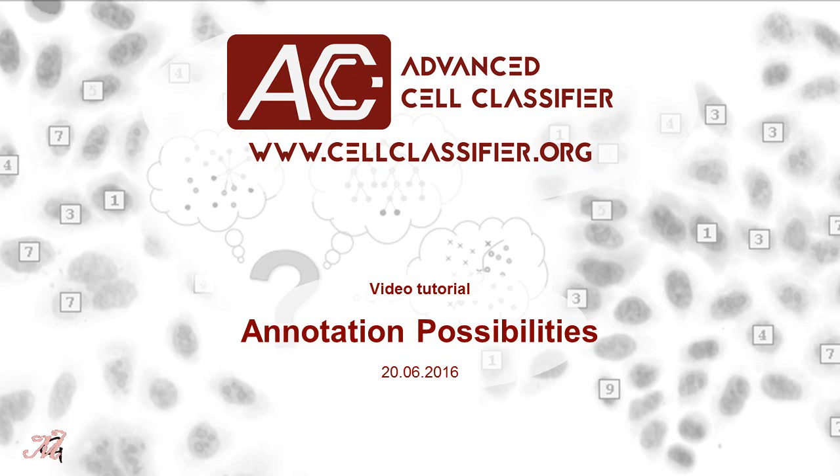Welcome! In this video tutorial, I will briefly show you how to annotate cells in Advanced Cell Classifier. Annotating cells is essential for supervised learning, during which expert knowledge is provided to the computer to enable automatic data analysis. I'm going to describe how to use the traditional and the more advanced annotation methods and, additionally, how to explore your data by using a weakly supervised method.